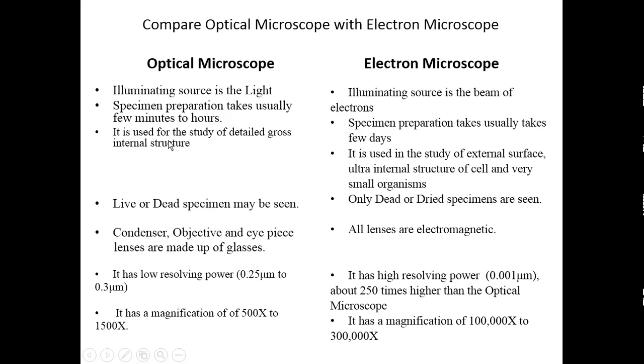Then in the optical microscope, we can have a live or dead specimen. Whether the specimen is live or dead, it can be seen.